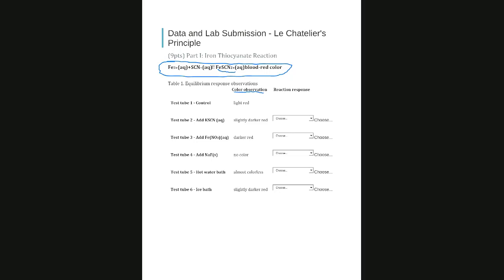We have 6 tubes. To perform this reaction, we mix iron and thiocyanate, and then we have a system at equilibrium. The 6 tubes hold the same system at equilibrium, from tube 1 to tube 6.